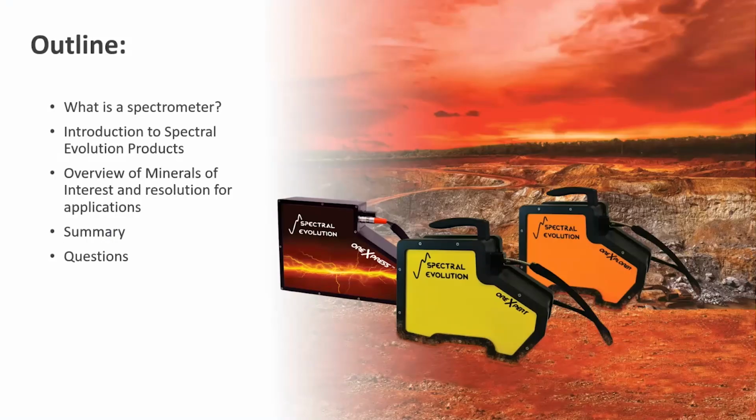So to outline today's webinar, like I said, what is a spectrometer? I'm going to introduce some of Spectral Evolution's products, and then go over an overview of minerals of interest and resolution for different mining applications or geology applications. And then I'll summarize it and open it up to questions.